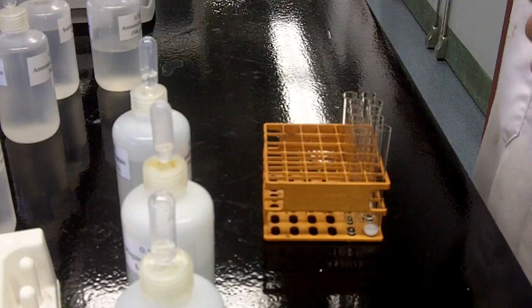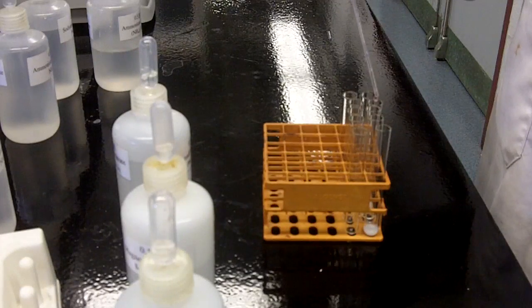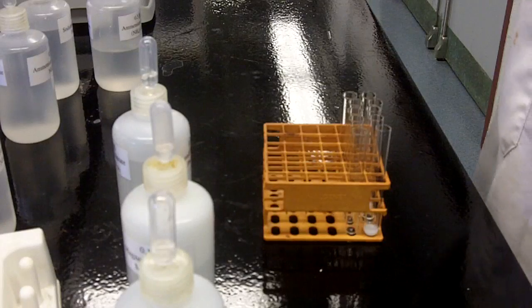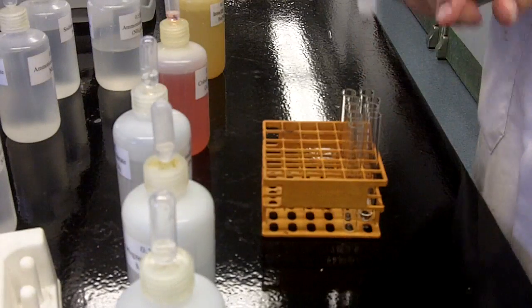The key here is keeping track of your bottles and making sure you're adding the right thing, because this lab turns out to be a nightmare if you screw that part up.